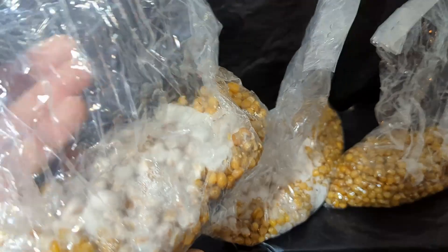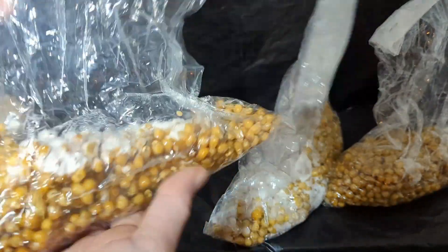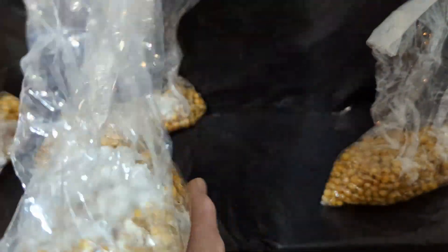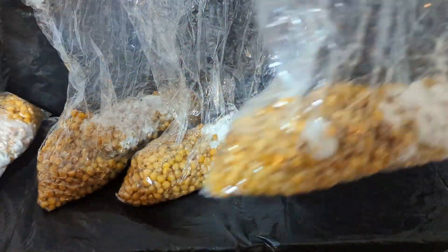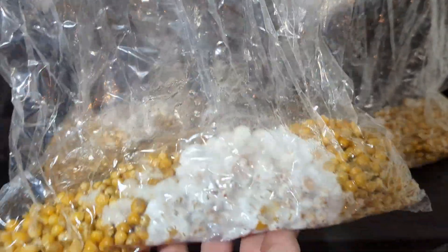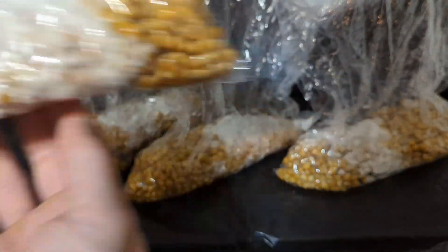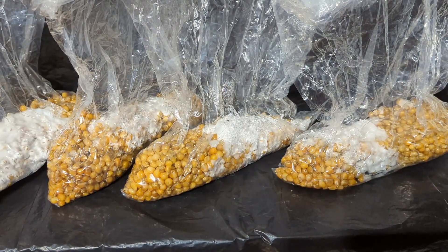Now let's talk about grain colonization. Once you add mycelium to the spawn, it will usually take one to three days for it to start growing on the grain. The mycelium will usually get fuzzy at first and then start colonizing. It takes about 10 days to two weeks — possibly a few days longer — to completely colonize the grain. If it takes much longer, it could be a sign of contamination, a problem with oxygen in the container, or grain that's too dry from not being hydrated properly.